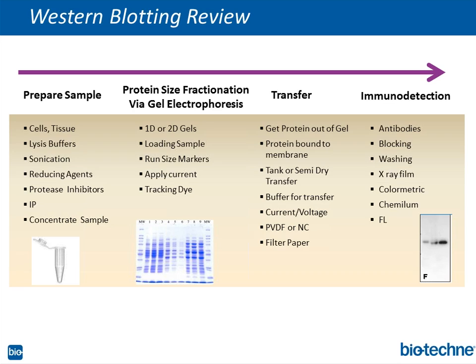We'll mention more of them at the end, but really you want to make sure that your lysates aren't old, that you minimize the freeze thaws, that your protease inhibitors and your phosphatase inhibitors are fresh, that you're catching the cells at the right passage number, and the cell density is not too high. You might have to do an IP to enrich for that protein.